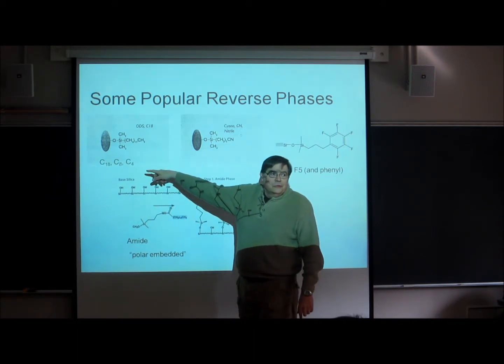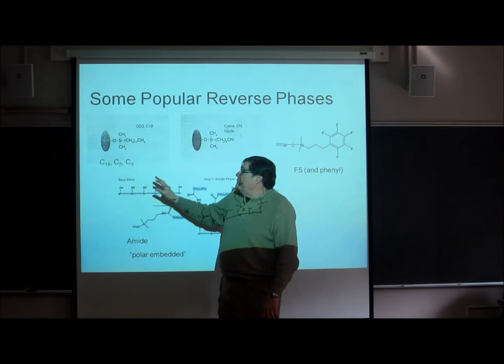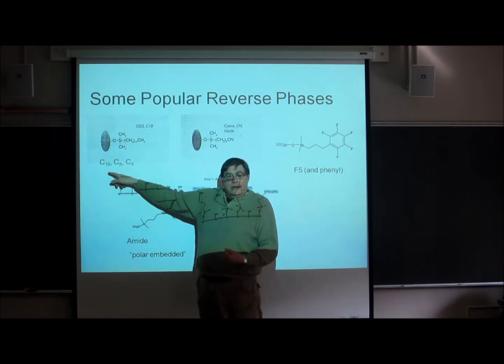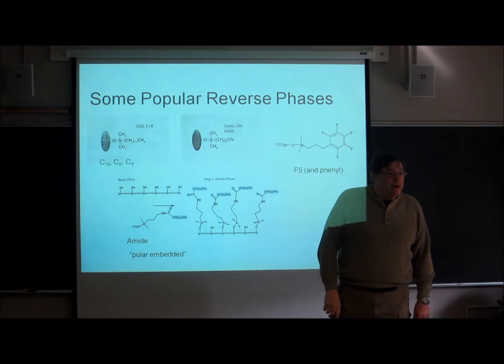Just take a guess. This would be the most oily, the long chain. This would be the least, C4. So what you find here is that C18 is the strongest reverse phase medium. It does the best separating. And C4 isn't nearly as selective as C18. It still does its own job.